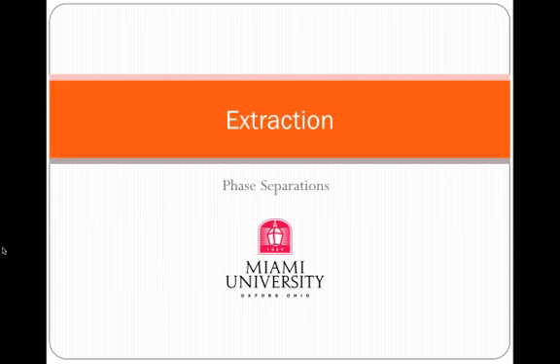This is Rich Taylor, Miami University, and the topic of this presentation is extraction using phase separations in order to purify compounds.